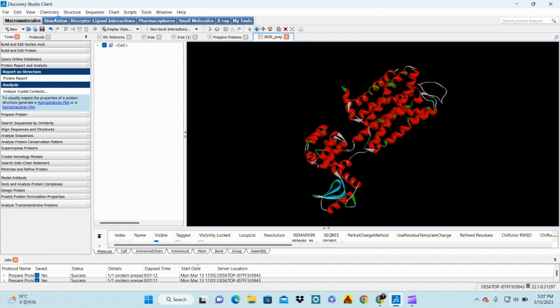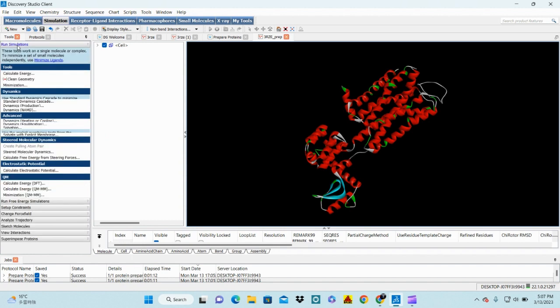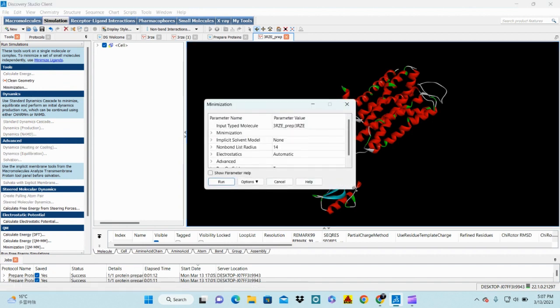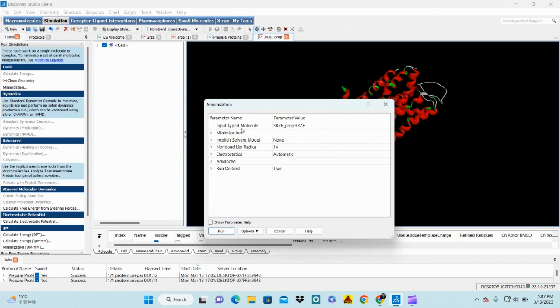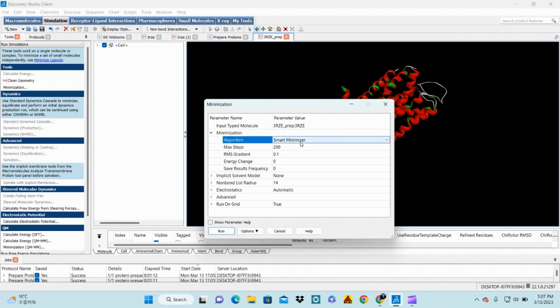The next step is to run a simulation to minimize the energy of the protein and make it more stable for molecular docking. Click on Run Simulation, then click on Minimization. In the minimization settings, set the input type to your prepared molecule. There are two steps in minimization — first check that the algorithm is set to Smart Minimizer.